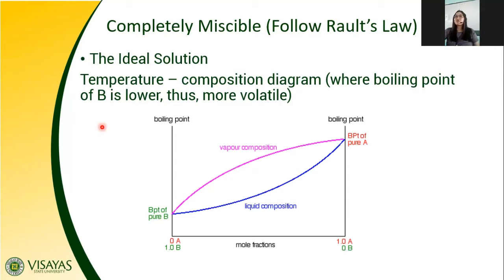It is very important to know the composition of that particular component, so that you are able to determine the amount of that component converted to that particular phase at that particular temperature or pressure. With our experiment, which is supposed to be done in our laboratory, we will deal with the temperature composition diagram.